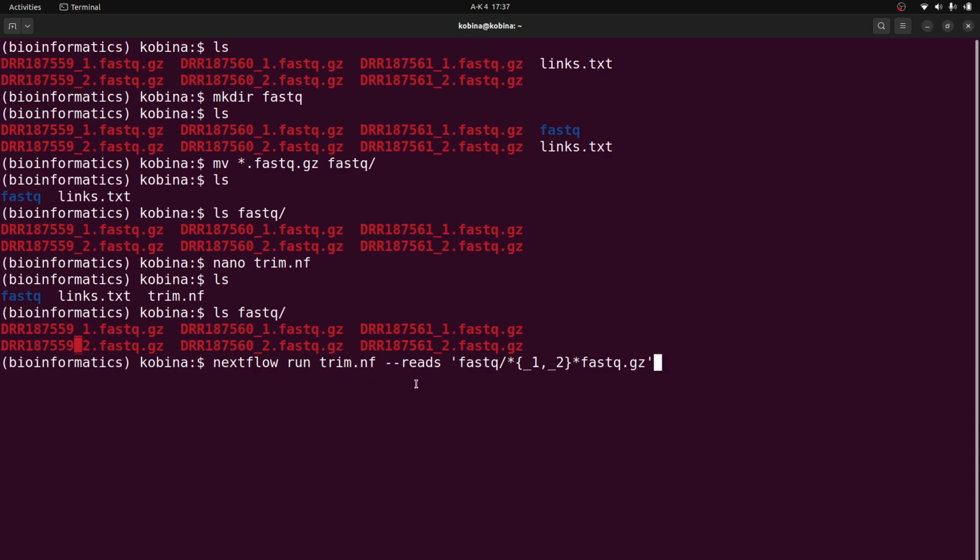I've covered this approach in detail in another video, so if you want to get more details on this, you can just check the description box. The link to that video is there. All right, so let's run this simple script to see what we get.